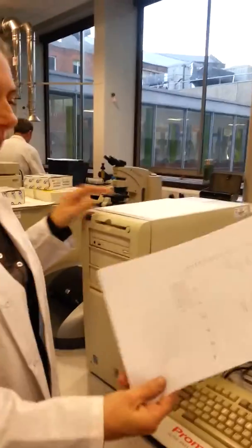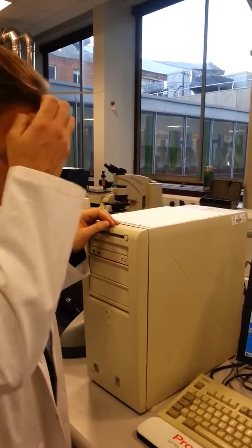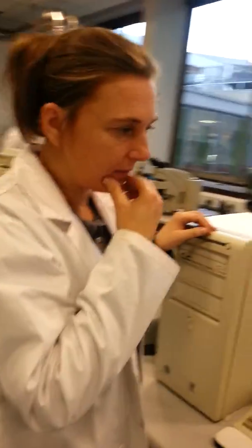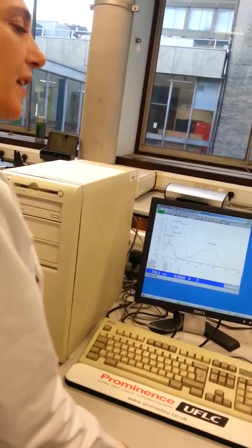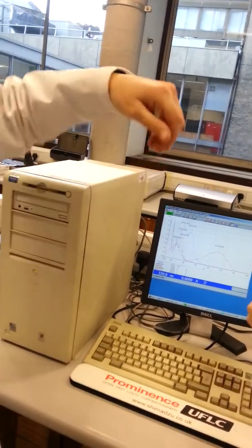So there's your spectra. Yeah. Thanks. And next week you're going to create quantitative standards to create 4 calibration graphs, which you're going to use to work out how much of each of those food additives are in an unknown sample.